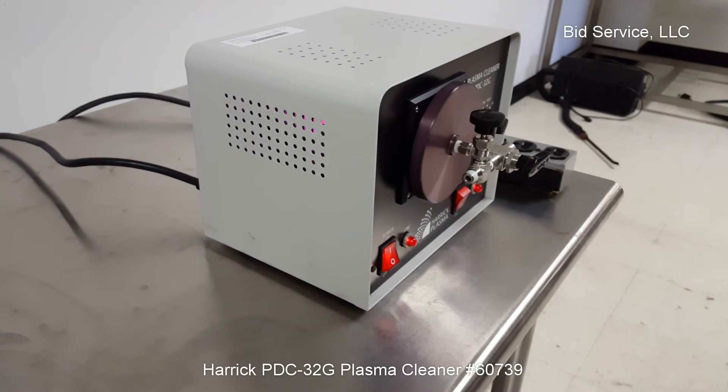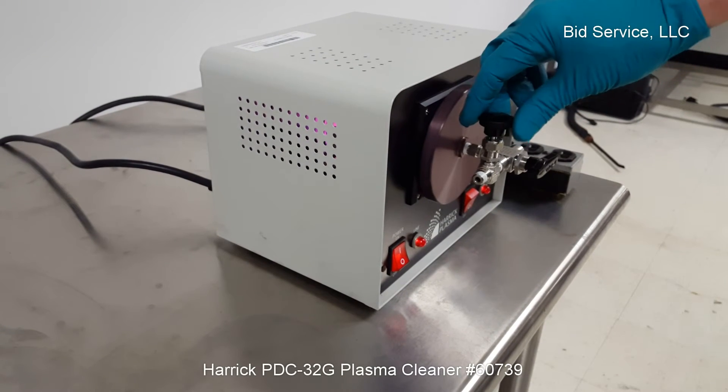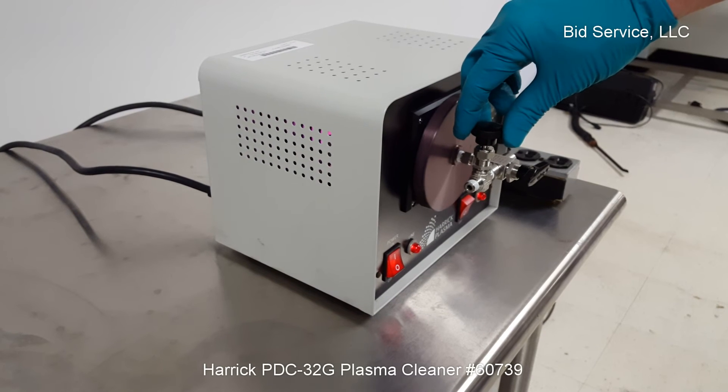The brightness changes. And your adjustment for your gas flow in would be using this needle valve.